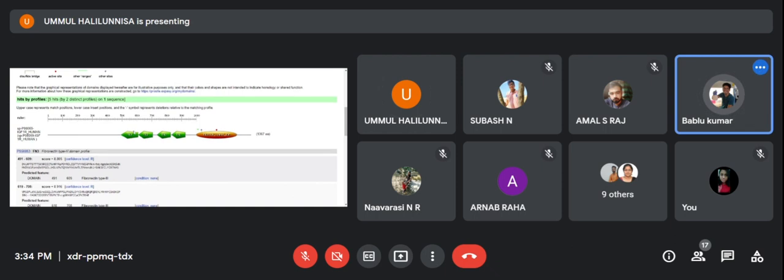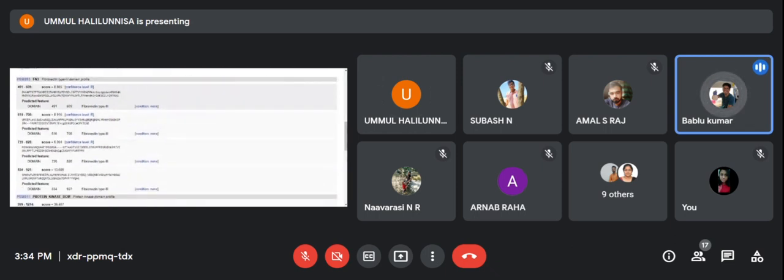Ma'am, can you paste the sequence in your chat box, or are you using the same sequence?